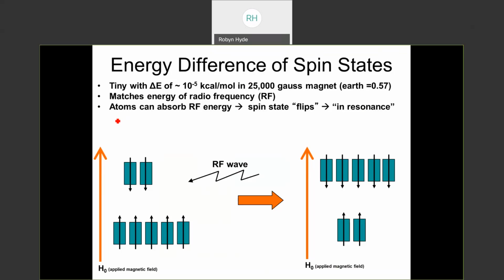Nuclear magnetic: we are taking our samples, putting them inside a magnet, and then irradiating with frequencies to put those atoms into resonance. Then we record what frequencies were required to put atoms into resonance. So then we just have this long list of delta E values and the atoms that match the delta E values, and that's how we interpret NMR. That's the fundamentals of how NMR operates.